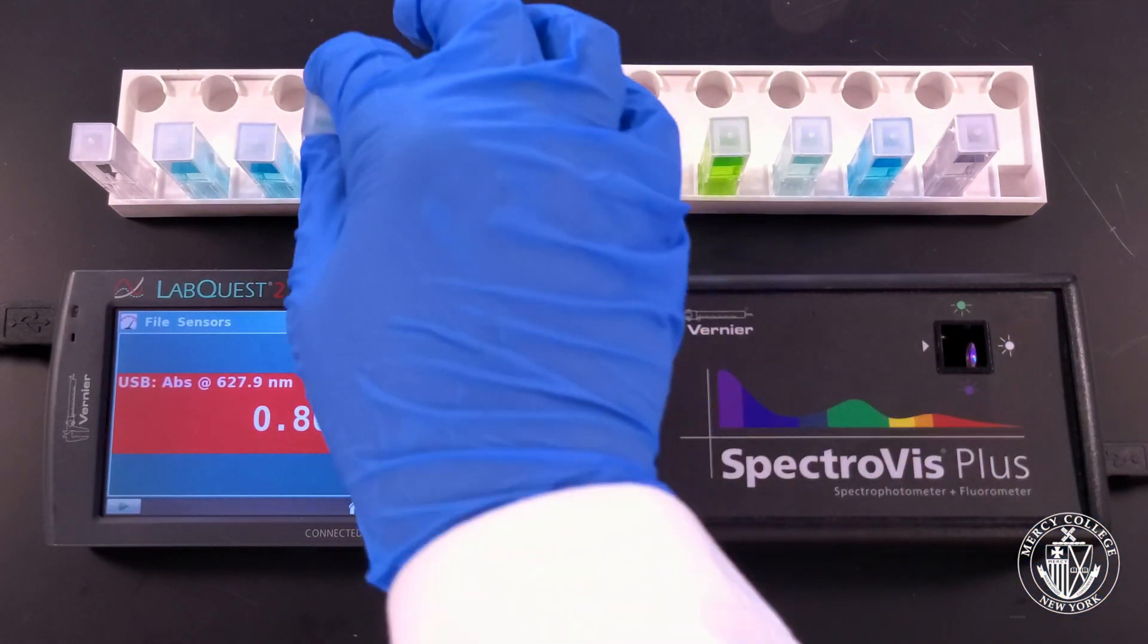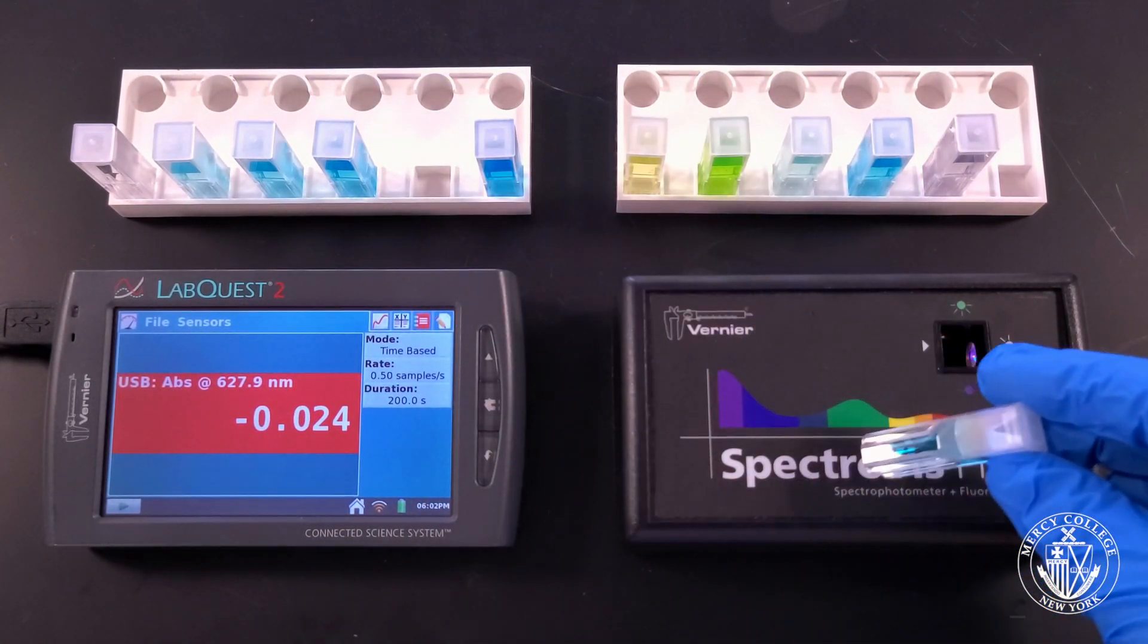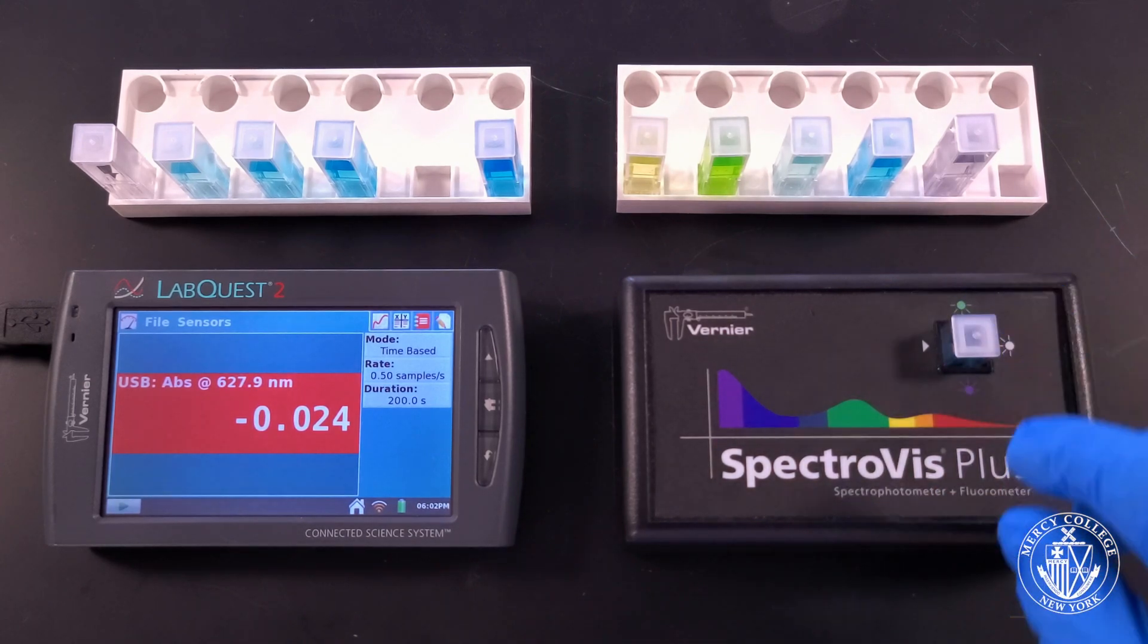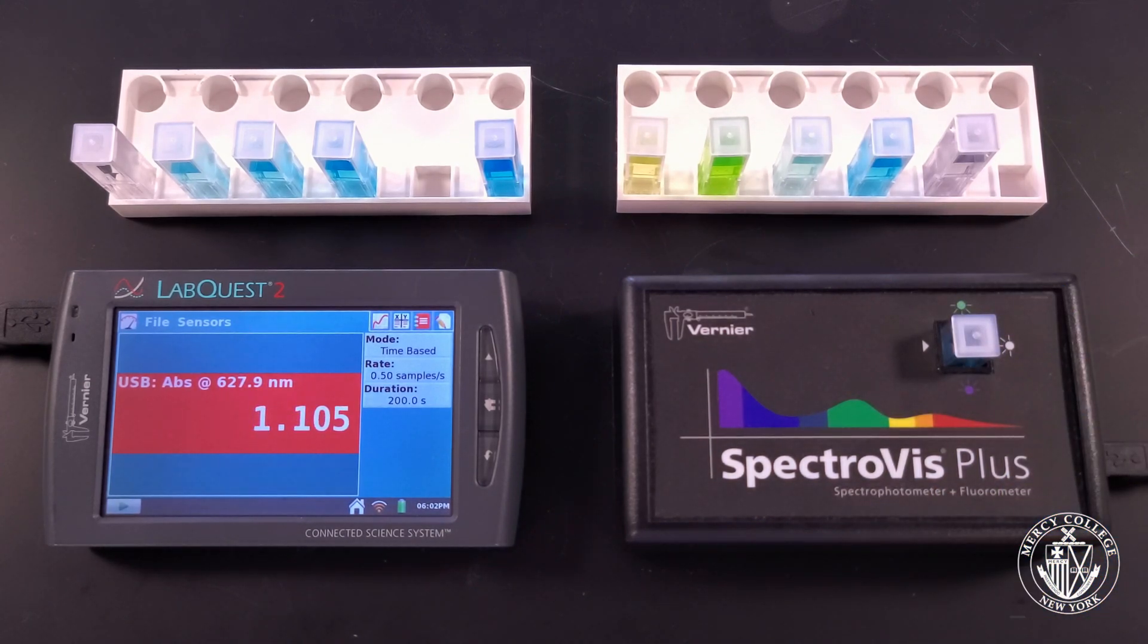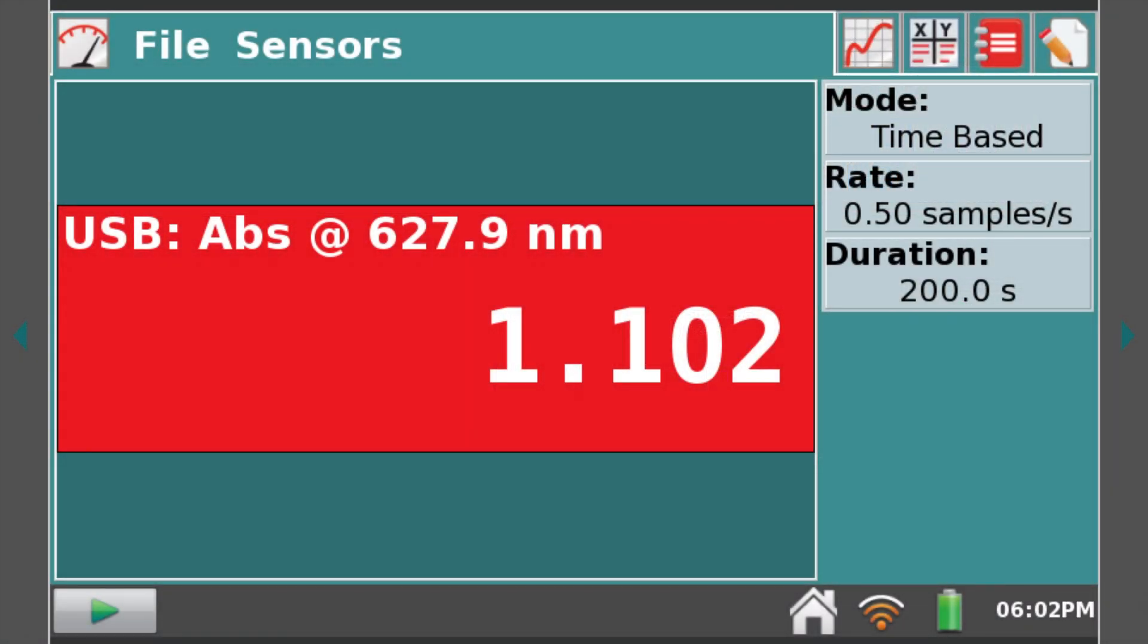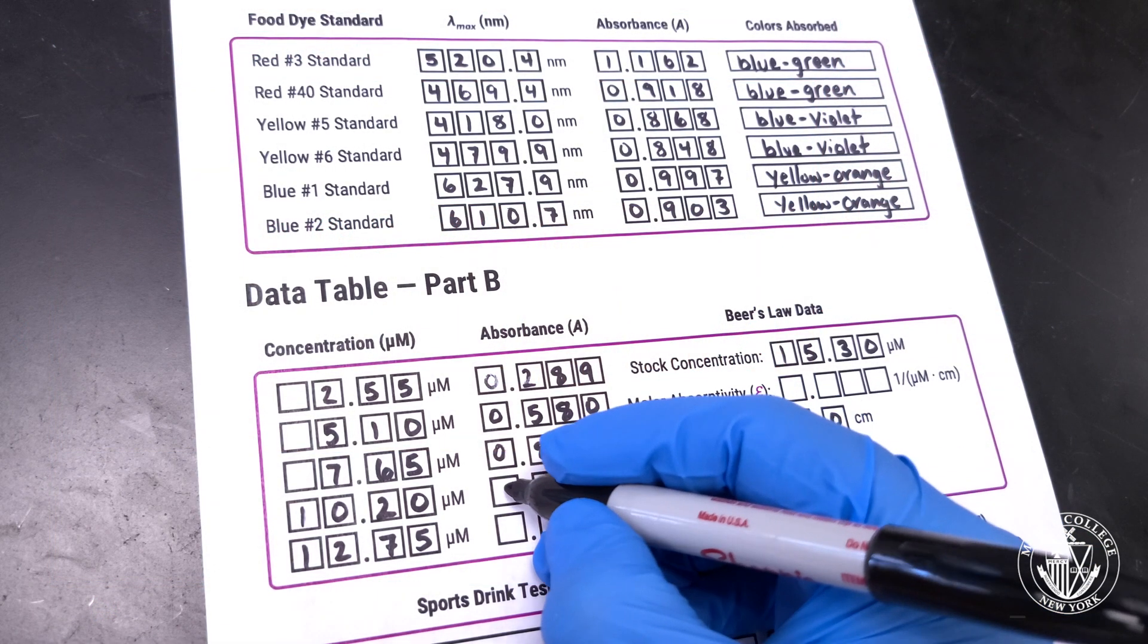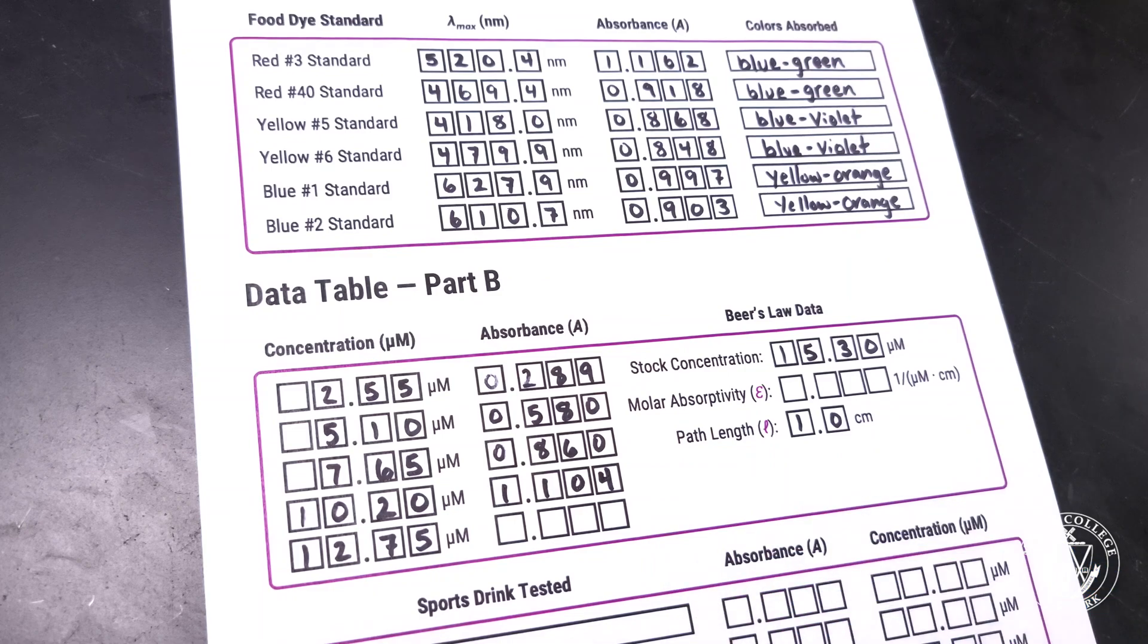As you continue to analyze your fourth and fifth dye standards, always make sure that the arrow on the cuvette aligns with the arrow on the spectrophotometer. Our fourth dye standard looks like it settled at an absorbance of 1.104.